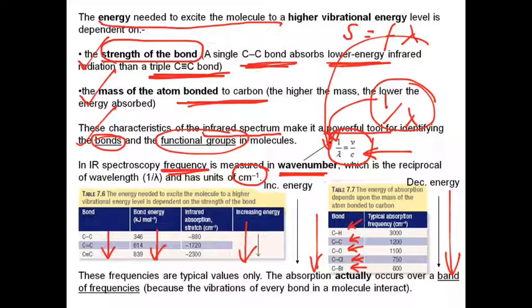The other thing to notice at the bottom here is that these frequencies are typical values only. The absorption actually occurs over a band of frequencies, because every bond in a molecule interacts. So the whole thing is interrelated and complicated. You have to think about it as a band of frequencies over which you can expect certain functional groups to absorb their energy.